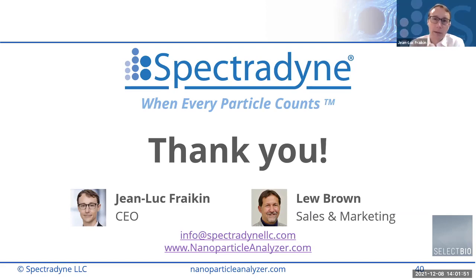Well, the limit of detection is 50 nanometers, and so we can't detect particles below that right now. I can tell you that we have done research measurements that have shown particle detection down to 35 nanometers. So it's the direction we want to move. But as you can imagine, it's a challenge to make pores that are small enough to detect those. I do think it's feasible, but it's just not commercially available right now. Does that answer your question? Yes.